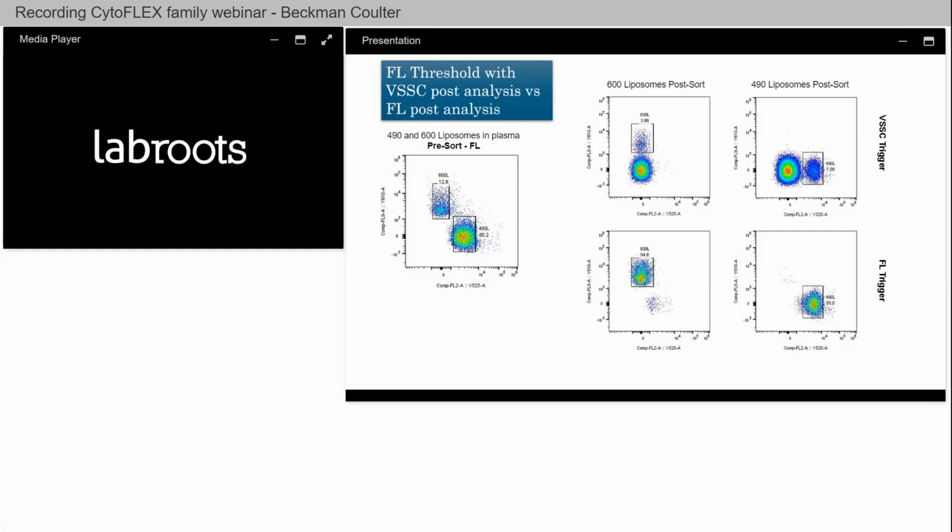It's a signal to noise ratio. As signal decreases, noise increases, because the noise is a constant value and where it's positioned. So the only thing that can change that is number of particles. So obviously, if you were to concentrate these and look at them on the scatter, you're probably going to enhance that signal and you're going to get a better perception of what's going on.